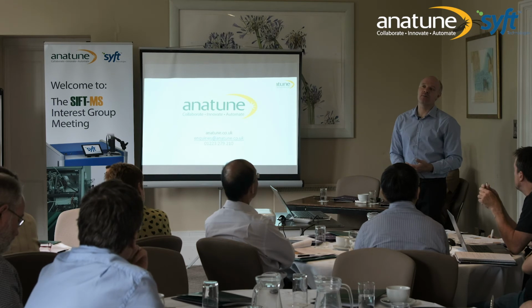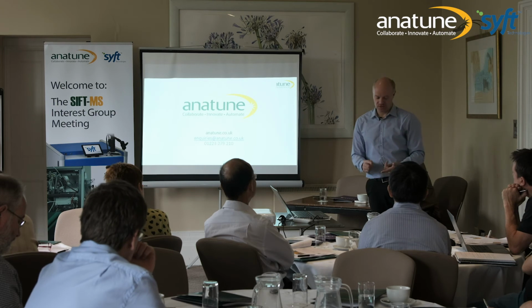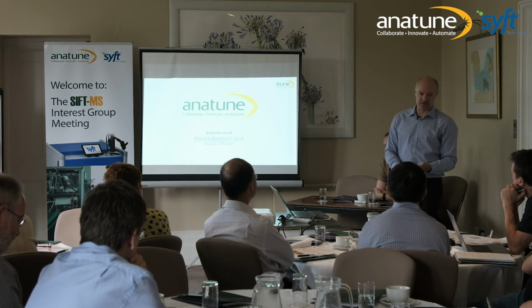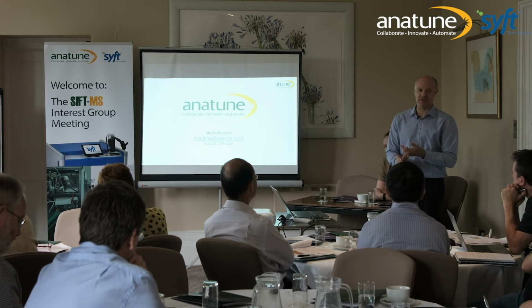I think you can. My feeling, having done this type of stuff for years and years and years, is you can pretty much do anything you like, as long as you say what you do, do what you say, and can justify it to the person that's asking you the questions. You can get into some quite robust conversations with the person asking you the questions, but if you have confidence in what you do, then that's fine. So make sure, that all comes in the method development part of it. You've done enough development that you have your arguments set already for the conversation you're going to have with your auditor. And you tell them to go away, you're wrong. That's what you do. They don't like it when you do that, but it has to be done.